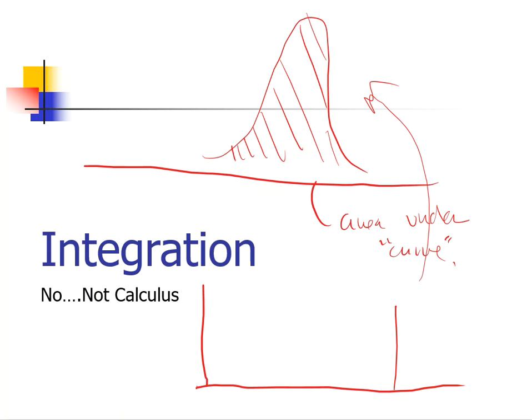So it's the same thing. We look at the signal that shows up with NMR. We look at the area that's under that NMR, and that area is something that's pretty important. And typically, most of the time, as the area increases under that signal, then the number of hydrogens increase as well. So it is proportionate. The area under the signal is proportional to the number of protons in the molecule that give rise to that signal. That is what integration is all about.